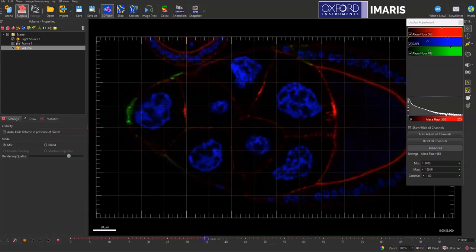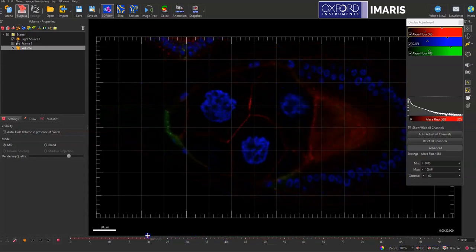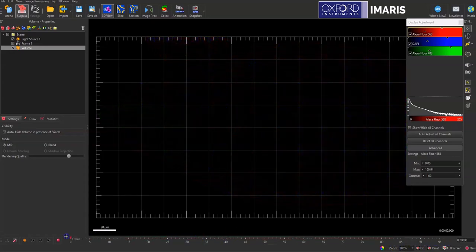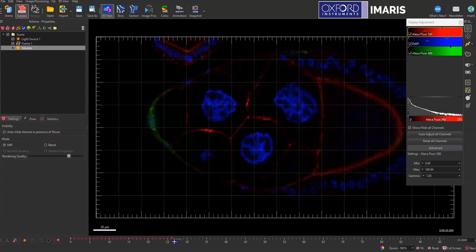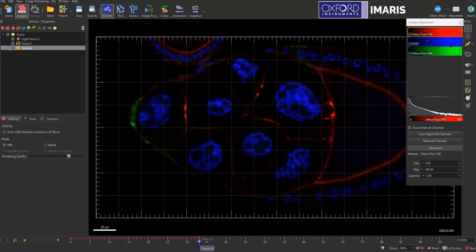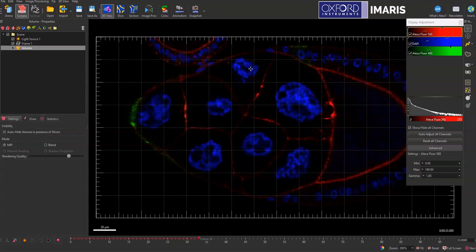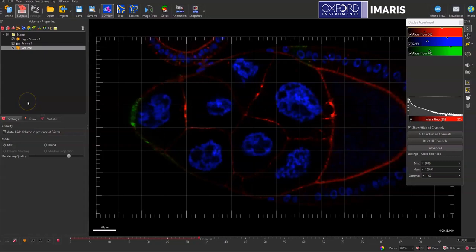I can now take this image, this mock time lapse, and measure all sorts of different things so I can make surfaces or spots or use any of the other modules in IMARIS and create objects that I can then generate statistics from.